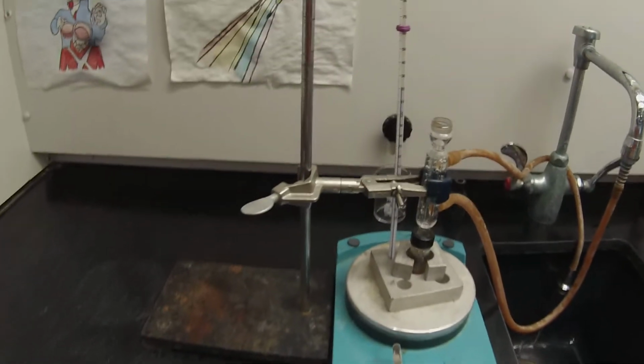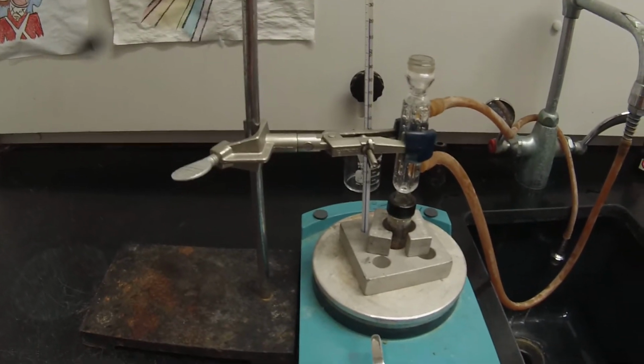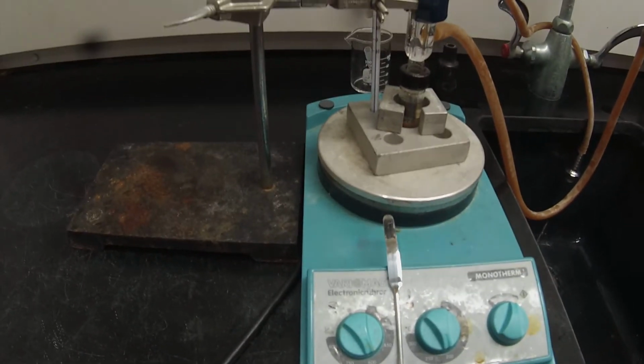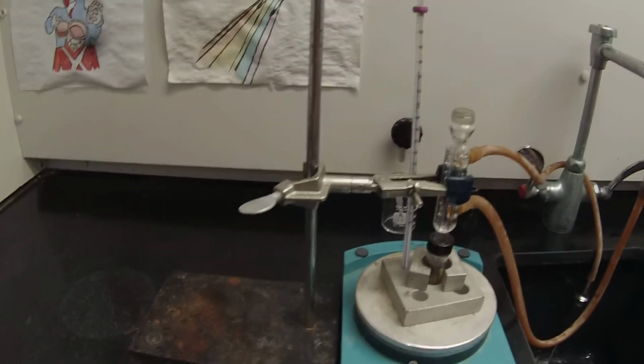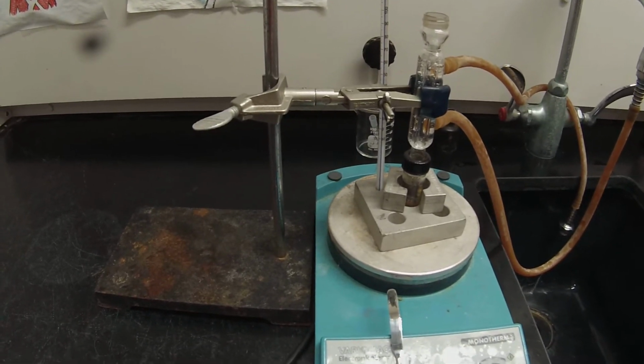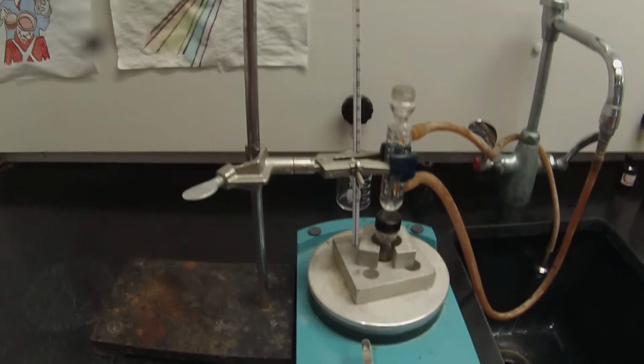See that the thermometer's up at 120 now. We don't see any bubbling yet, but we will shortly. n-Butyl boils at about 118 degrees.